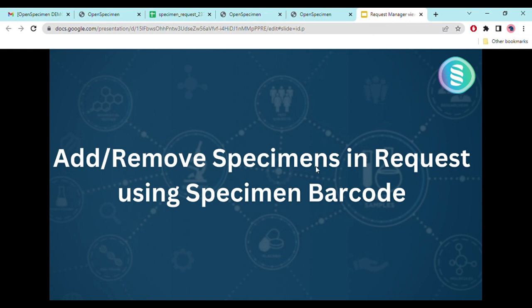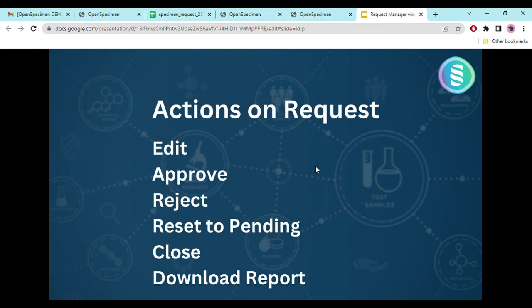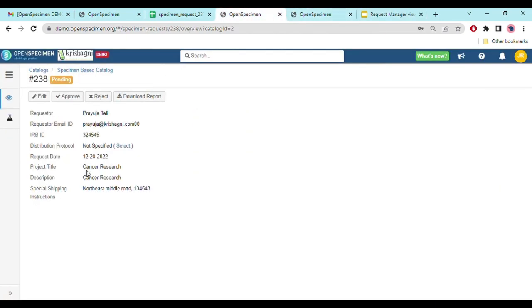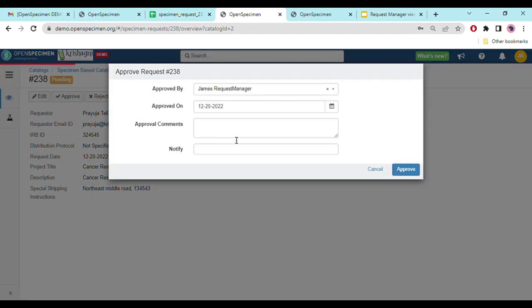This is how you add and remove specimens using labels and barcodes. Next, we'll see actions performed on a request such as editing, approving, or rejecting, and how to close a request. Navigating back to the request — once you are ready, you can see the Approve button. While approving, you can see fields for 'Approved By', 'Approved On' date, and a comments field for any specific notes.